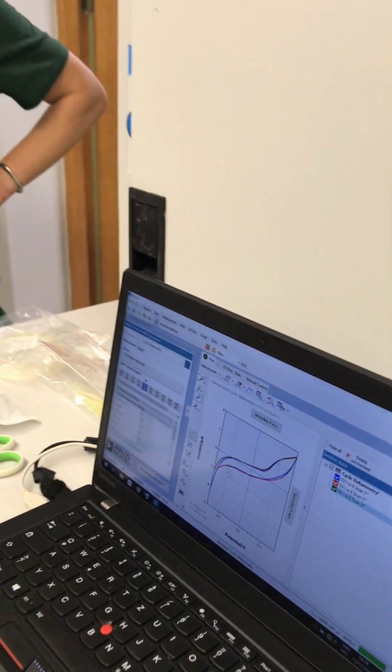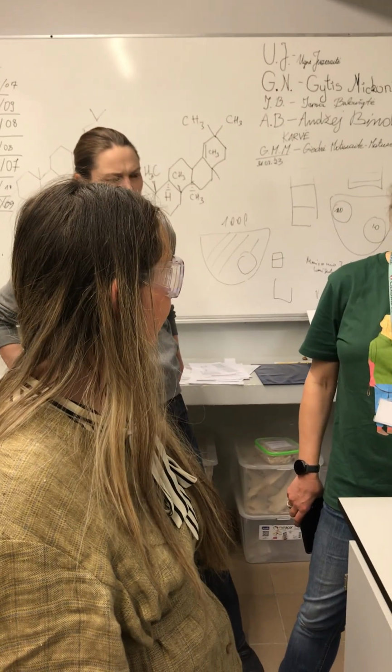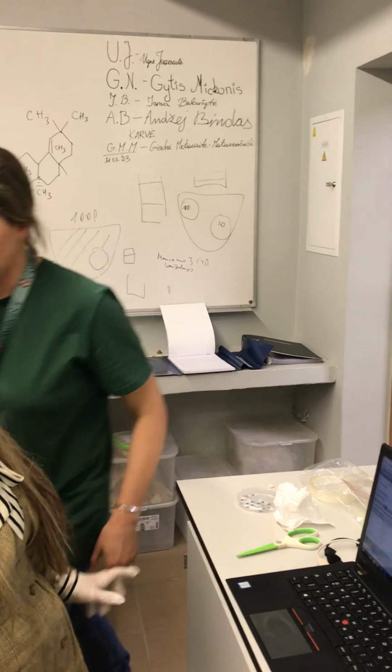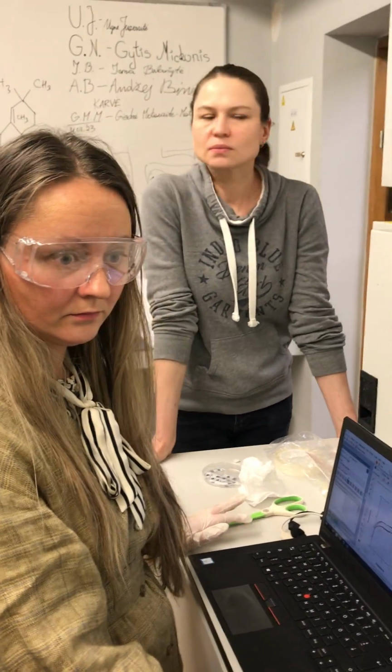And we record electrical signal change, which is voltage and current in this case. So shall we try one more liquid from my samples? Yes. Or two more? I at least have to finish at 3 because I have a live meeting.